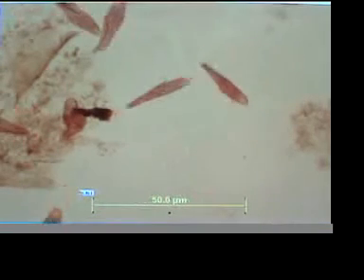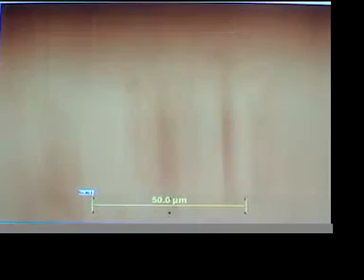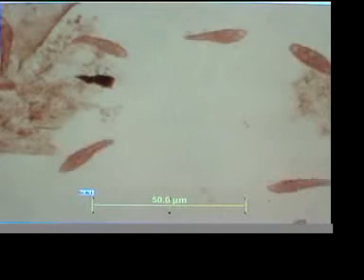So now I can tell you, you're looking at 2C, because this is row 2, there's the big 2, and A, B, C, D. Oh, it was 2D, right? And I go up and you'll see the D. So now I'm able to tell you what's happening. 2D, there's 2D. You get a little sample of what's happening in 2D. Now they're actually above the grid. They don't feel the grid. It's underneath the glass, below on the other side of the slide, so they get a smooth surface.